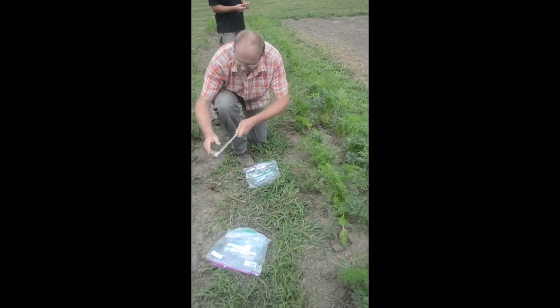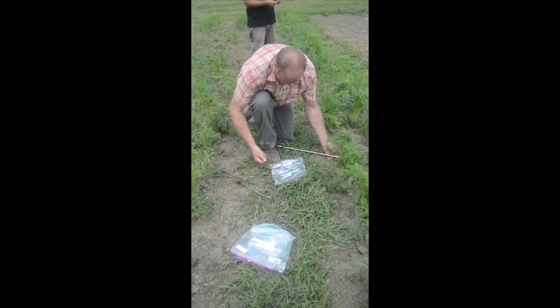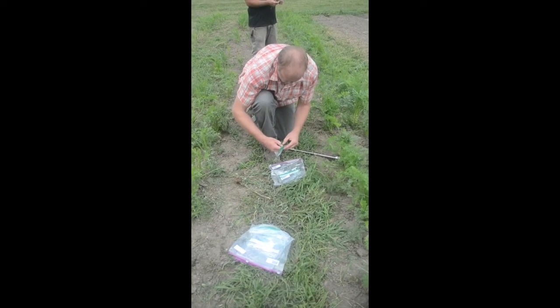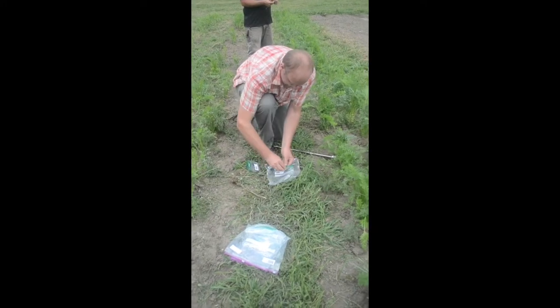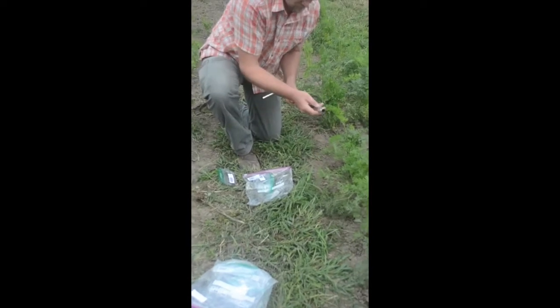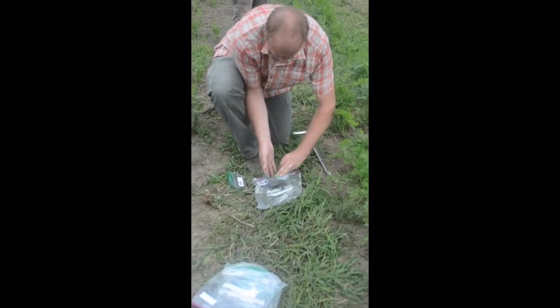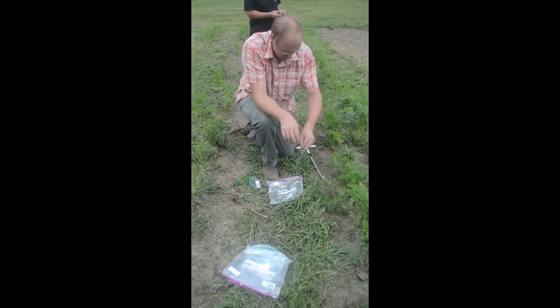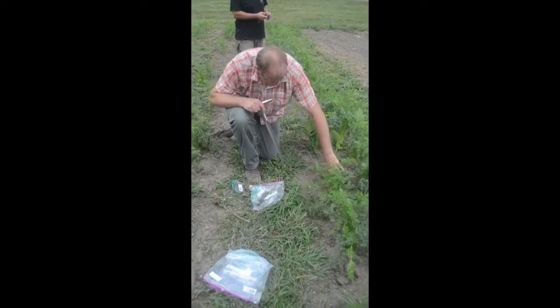Alright, so here's our first sample. Here's the 0 to 4 inches here. Should have opened the bag before I did this. And now this amount of soil isn't quite enough for the test that we need to do in the lab. So I want to get one more soil sample from around this carrot.